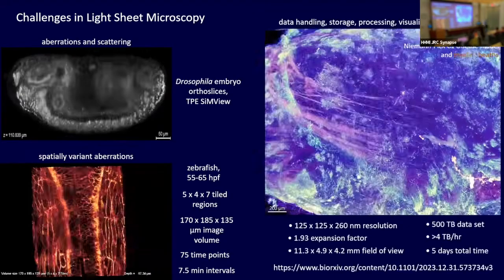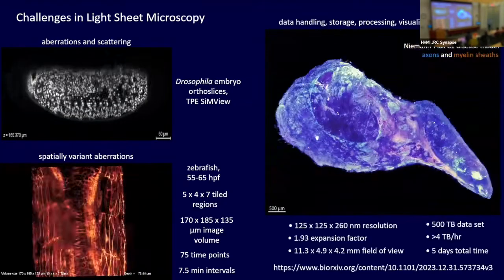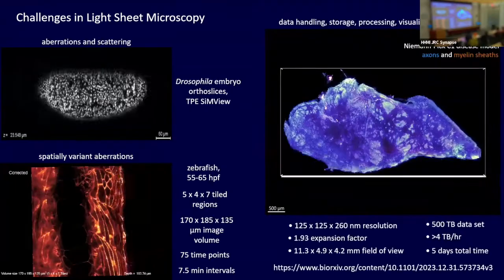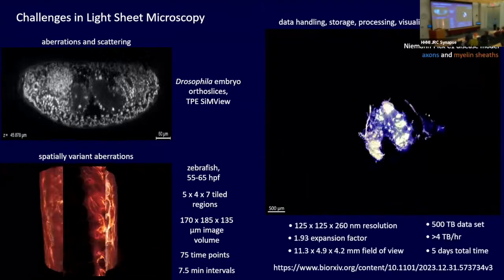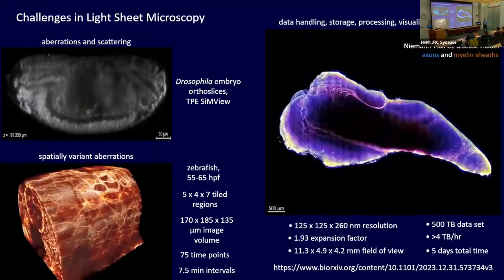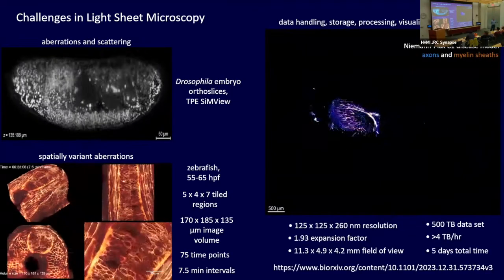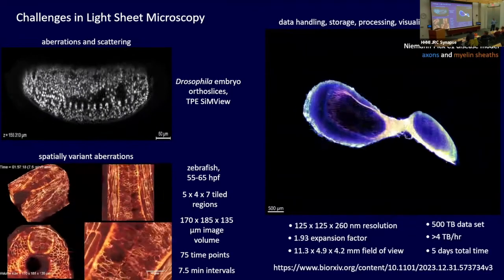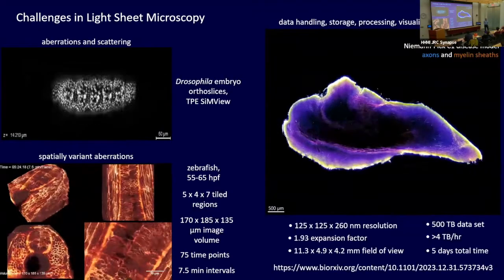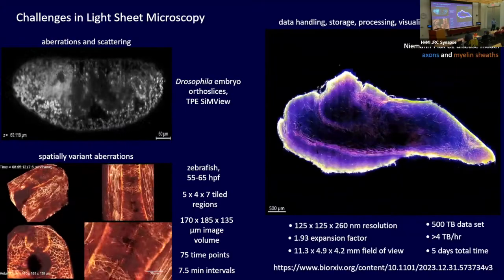And then finally, because of these limitations in doing live imaging by light sheet, the vast majority of light sheet now is by using chemically cleared and fixed specimens. So we already talked about fixation problems, but with these clearing techniques, you can get truly massive data sets, and people are getting massive data sets now. One of my biggest beefs about microscopy today is people take oodles of data, terabytes of data, and then don't do anything with it. They don't know how to do anything with it.